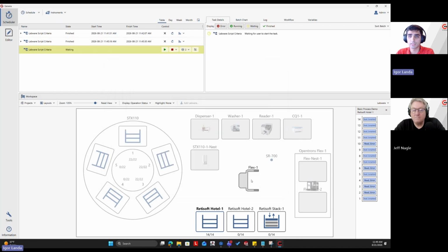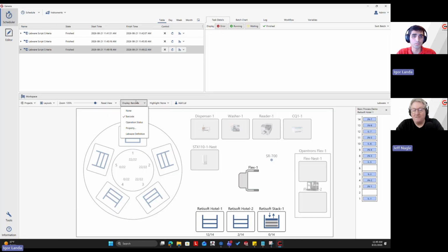And if I click next and then start, there we go. So as you can see there's some read error still here, but if I was to change this to barcode, we could see that they're JN. Oh, actually, there was one more. Yep, they're yours that have that error. But as we can see, it didn't pick that last one because I needed a batch count of 2.